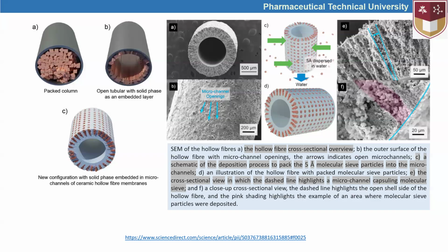If the sorbent and the compound have higher polarity, that could be suitable for polar compounds. If the compounds are non-polar, some non-polar solvents could be useful to retain them. So these are the figures with which we can understand how the separation occurs. Again, I recommend you to watch the chromatography videos.